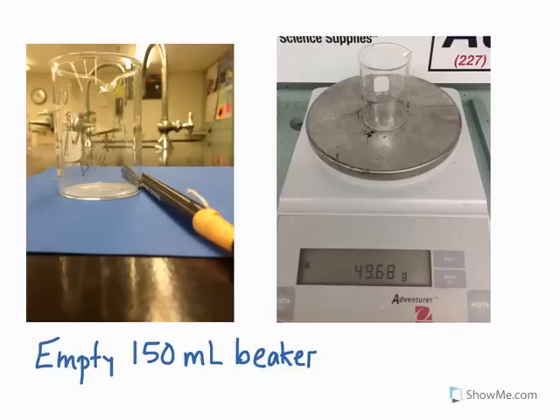As the reaction proceeds, take some time to get ready for the second part of the lab, which will be for day 2, by labeling your 150 milliliter beaker with your name or initials and your class period, and then weigh your empty 150 milliliter beaker on the balance, and record this in your data table.